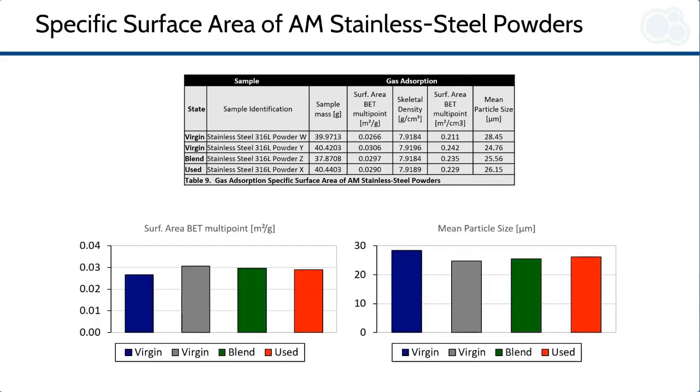The particle size distribution determined using gravity sedimentation, along with the SEM images shown, indicate an increase in the number of fine particles present in the used sample and an increase in the number of agglomerates. The fine particles perhaps were satellites removed from the surface of other particles, while the agglomerates formed by merging of two or more particles at basically point contacts.